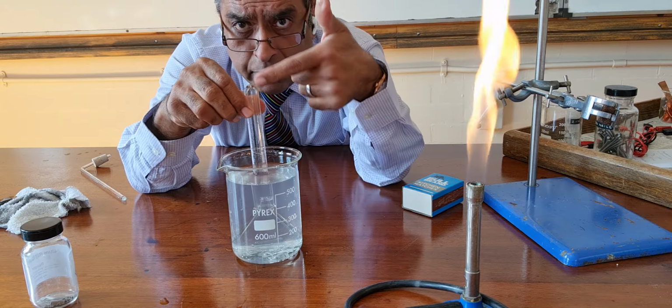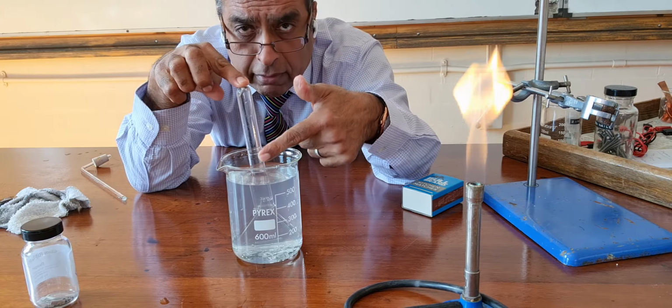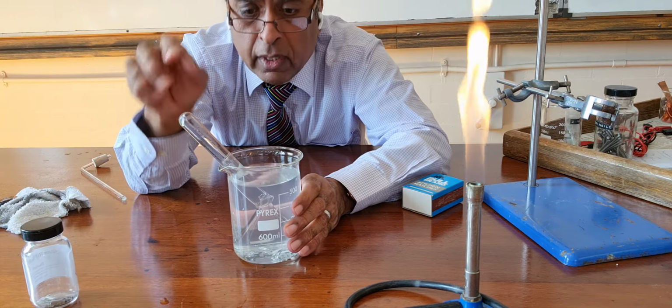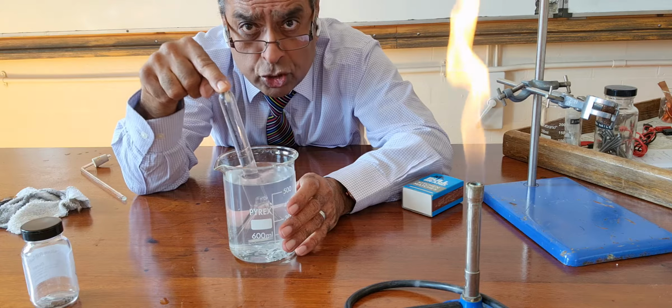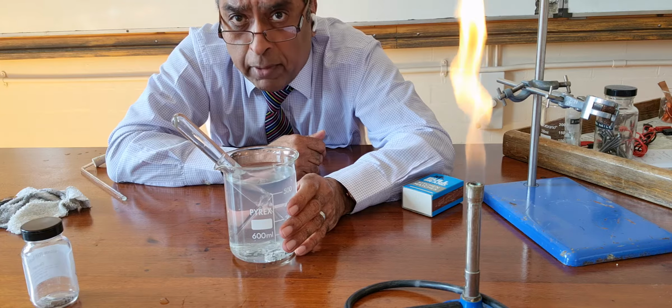And as the bubbles of hydrogen go in here, they'll push the water out. After about a week, I should be able to prove I've got hydrogen by testing the gas in the test tube and proving it is indeed hydrogen gas with the squeaky pop test.